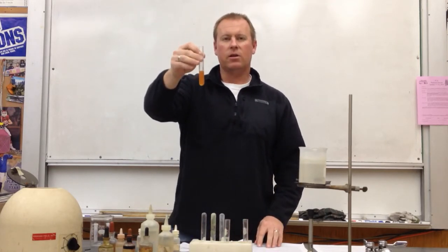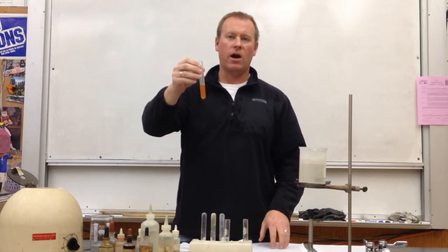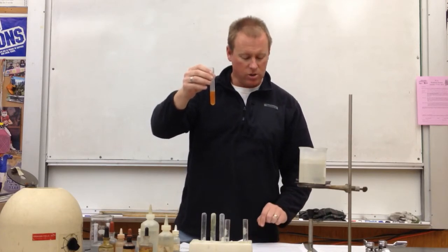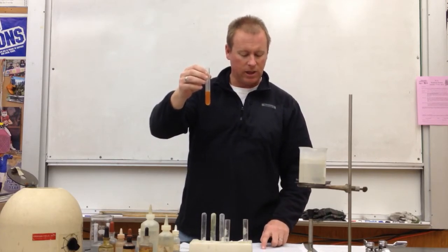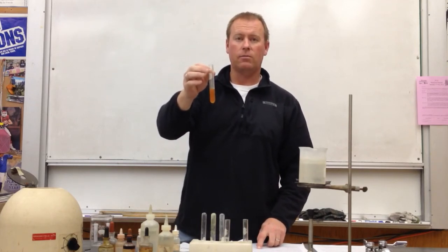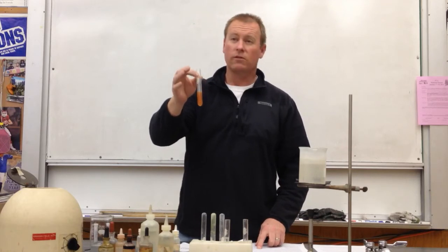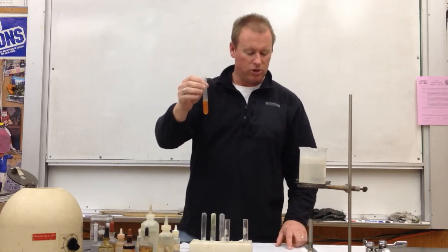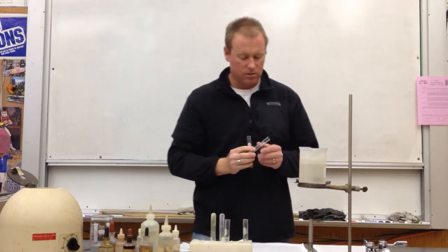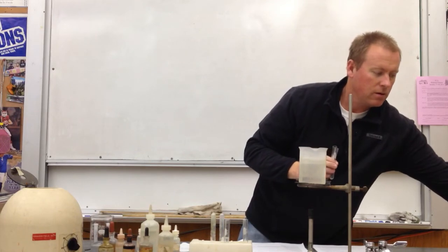Steps 6 and 7 are a unique set of steps because they test for the possible presence of iron, and then in the next step to confirm the presence of iron. So this rust-colored precipitate indicates the possible presence of iron. There's a good possibility that we have it, but we have to continue on to step 7 to check and make sure. So to finish step 6, we're going to centrifuge and decant, setting the solution aside for procedure 8, and we'll treat the precipitate in step 7.